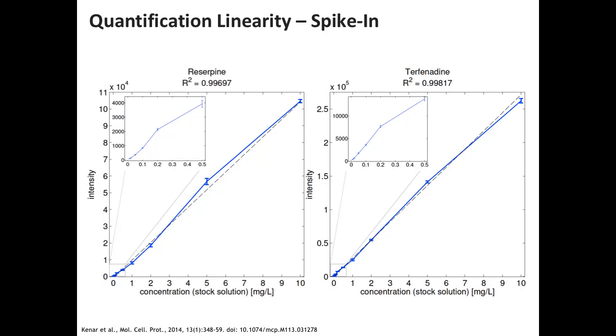But we had these questions of sensitivity and specificity early on, and that is much harder to quantify, because technically we don't have a ground truth. So even if the feature finder detects something, you cannot be sure what it is, and you cannot exclude that it's not really there.